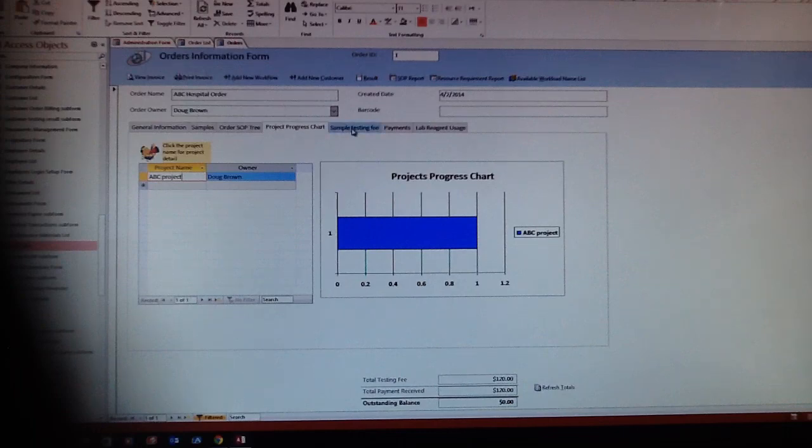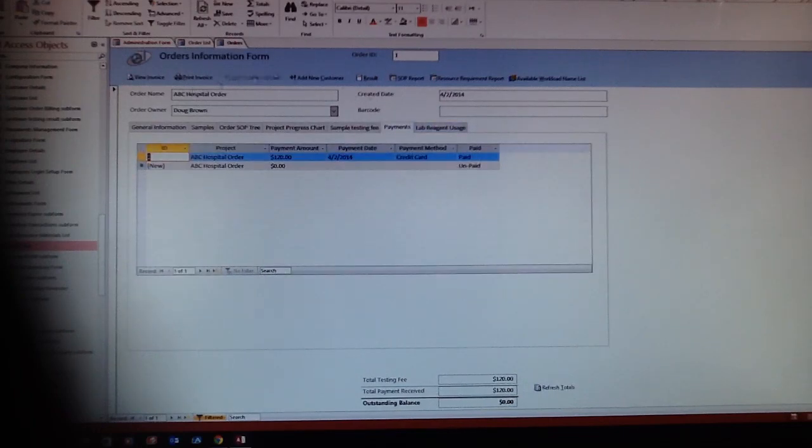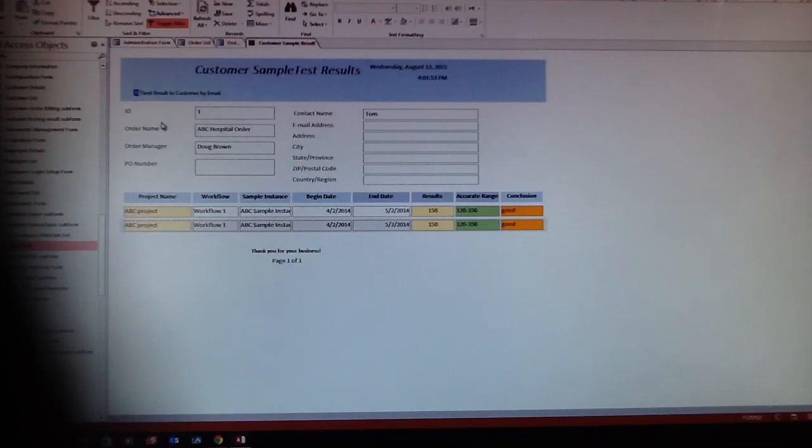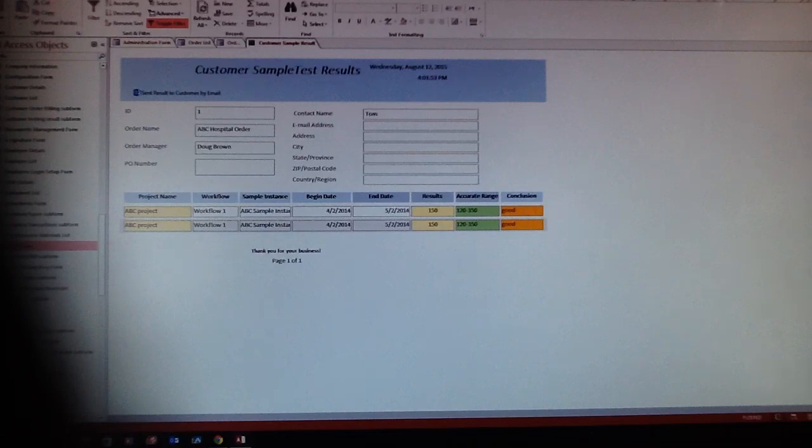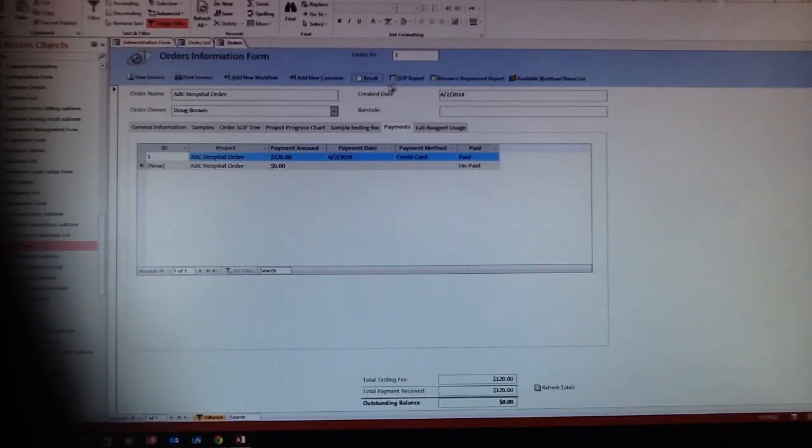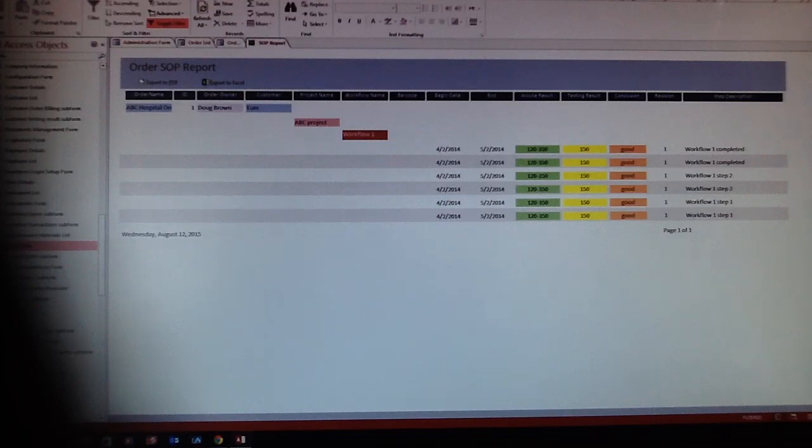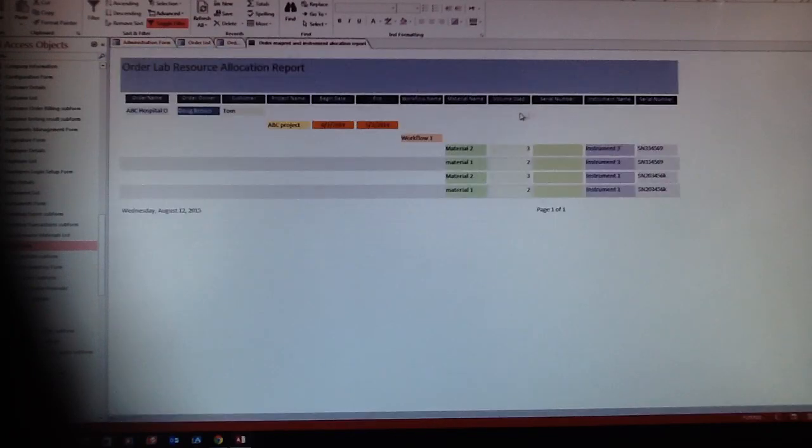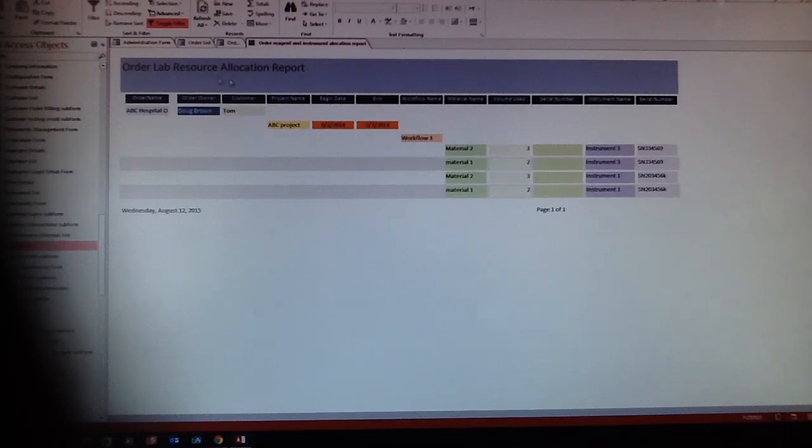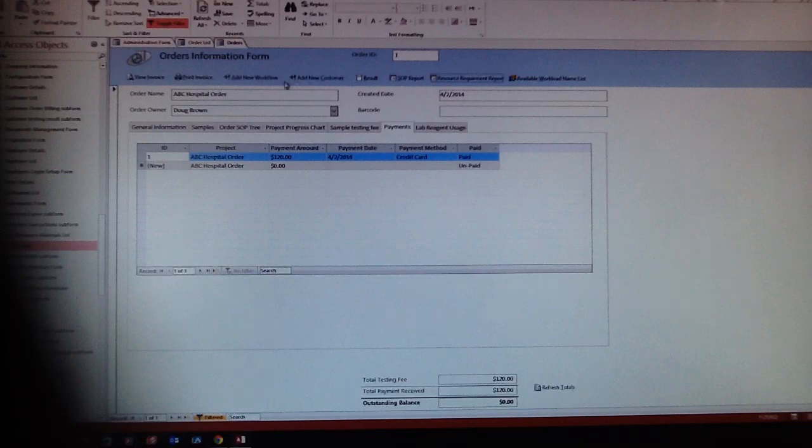Here is the testing fee payment. With that, you can check the results, the customer sample test results from here, and say it's good or bad. We put some accurate range results and the conclusions here. Also, you can print out the SOP report, the SOP report and resource requirements, allocation reports, and everything set here.